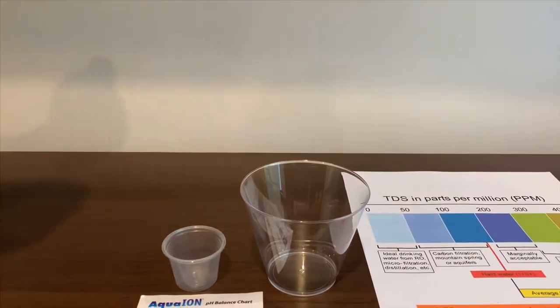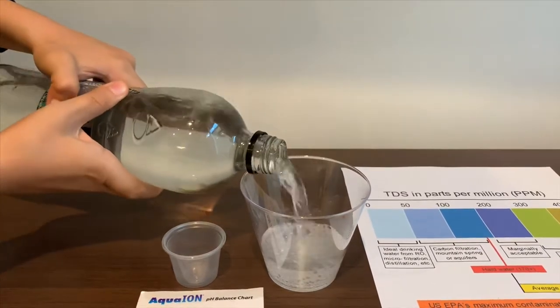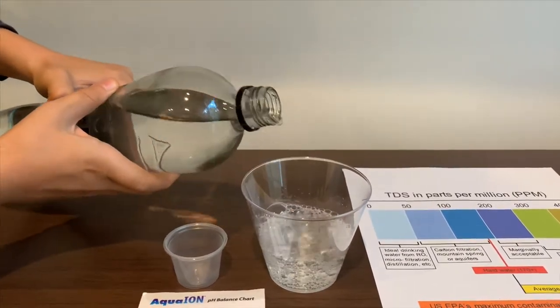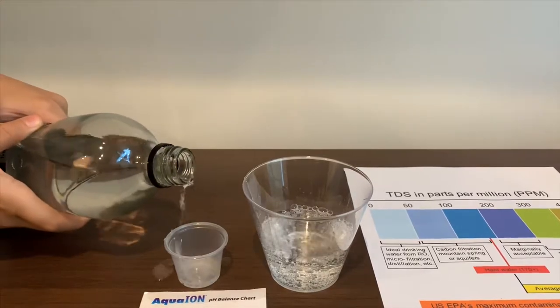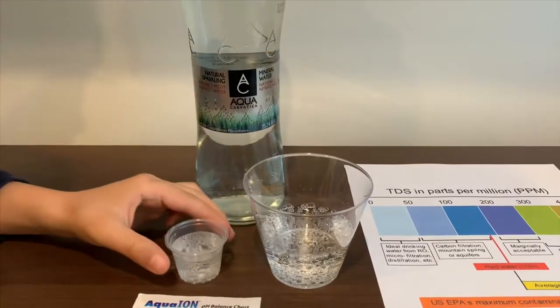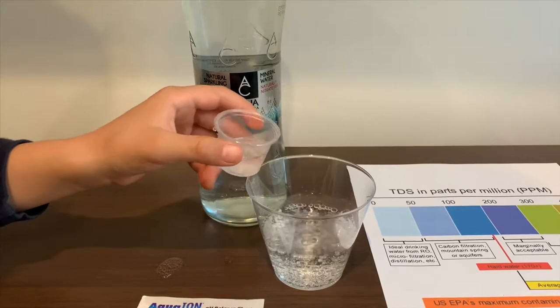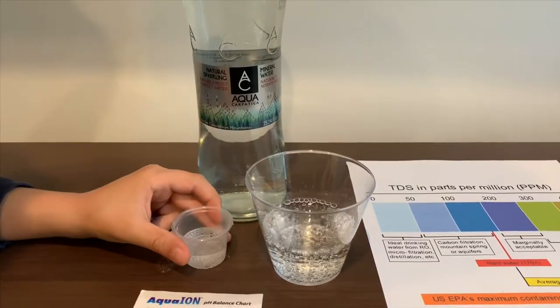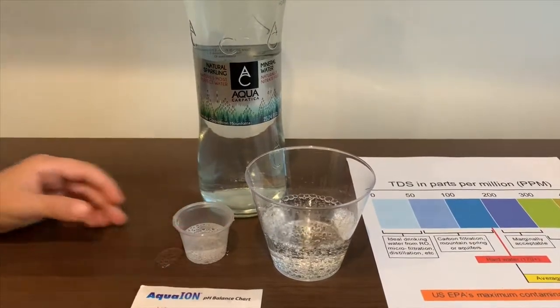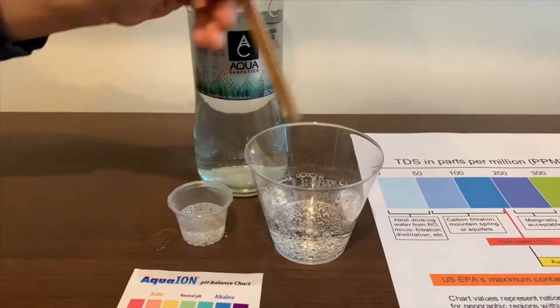Let's pour some water in. This is a little too much for the pH cup, so let's pour some back into the TDS. First we are going to test the TDS level, but we are stirring a little so we will get a better result on the TDS.